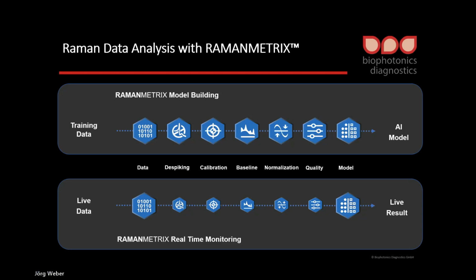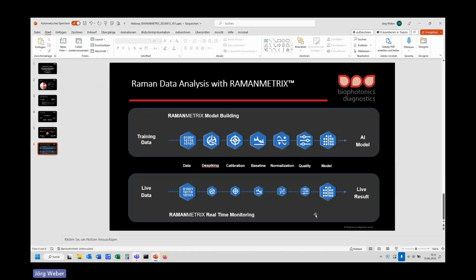So, this is what I wanted to show you in principle at the beginning. And then before we come to the RAMANMETRIX part that will be presented by Oleg, we have the second question for you. In the field of data analysis, what is your main need, or your main field, what do you use data analysis for? So please answer that question too, and then we will see how it looks like with our audience today.